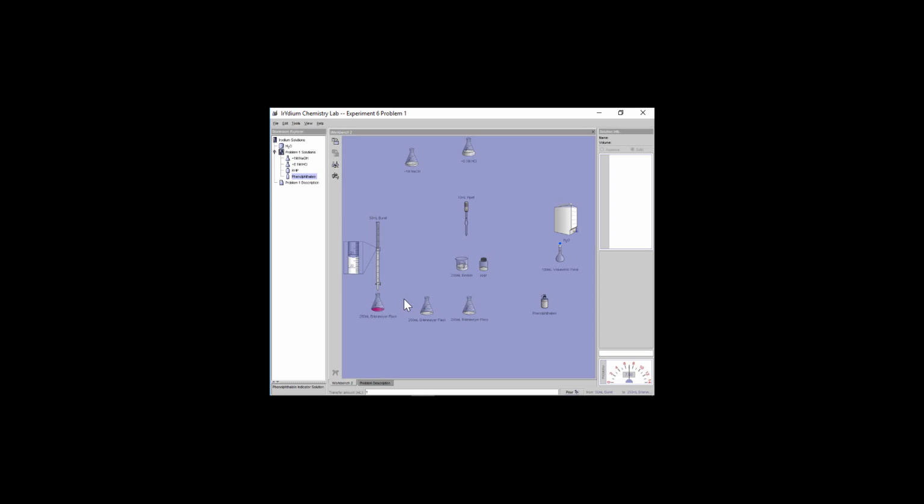So my V final currently, I'm going to change the number a little bit, is 21.26 plus or minus 0.05. If you do a quick difference between the 11.24 and the 21.26, I've added in roughly about 10 milliliters. This one here would be overshot.